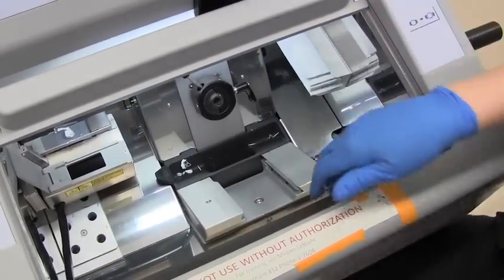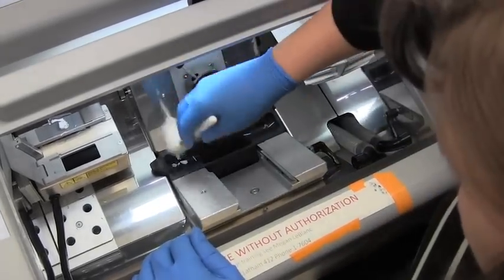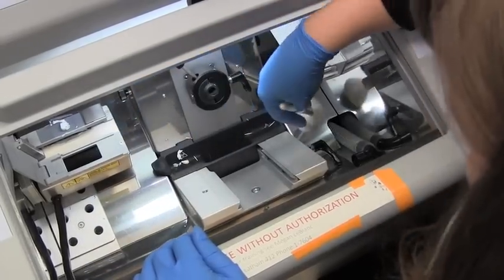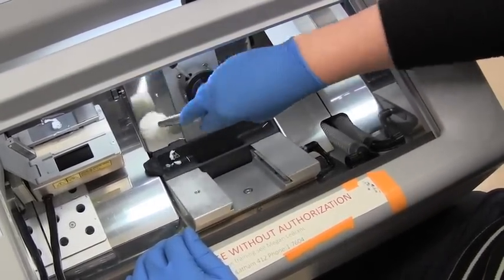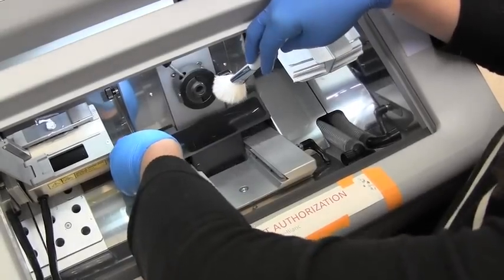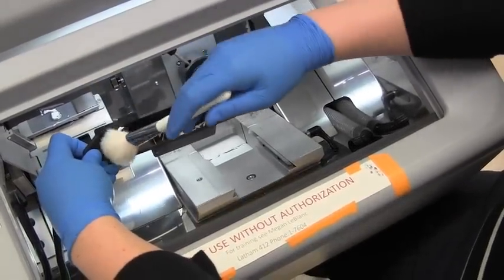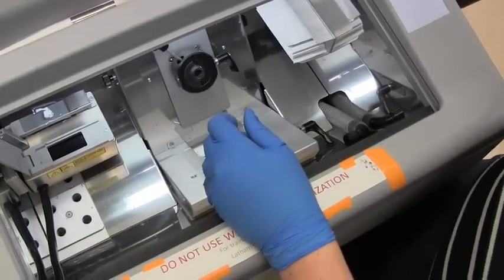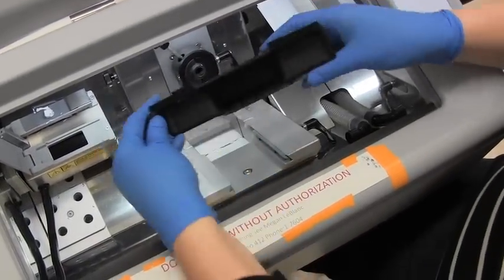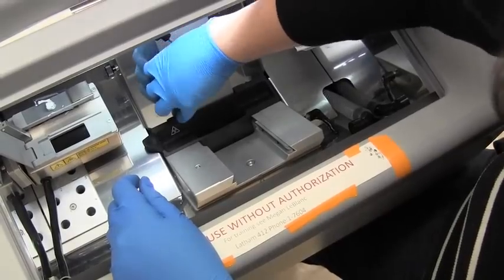Taking our brush, try to brush any extra slices of matrix that might be floating around in here and get them to fall in. You can see inside — all of our cuttings have ended up down there. These can just be dumped. There are still a few stragglers.